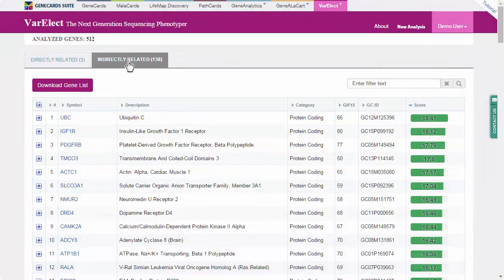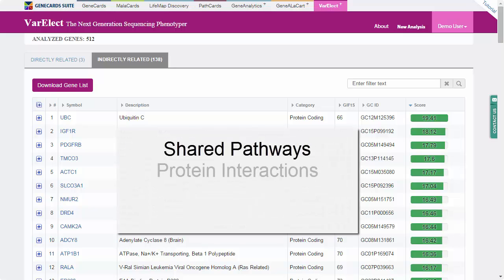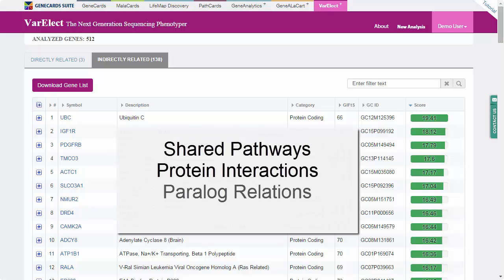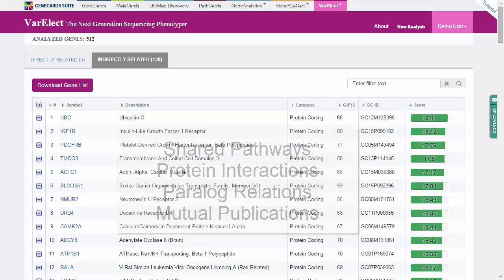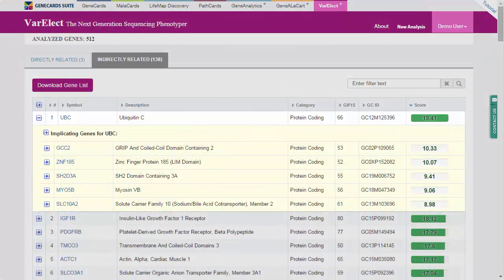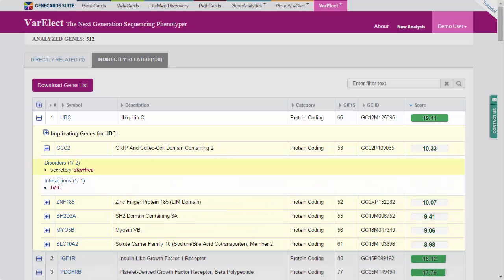Now let's take a look at the second tab — genes that are indirectly related to the phenotype. This information is especially relevant in cases where strong direct links to the phenotype were not found. These genes are associated with the phenotype based on shared pathways, protein interactions, paralog relations, and mutual publications. Expanding the row for the first indirectly associated gene, UBC, shows up to five genes which implicate UBC as associated with diarrhea and their scores. Here we can see that diarrhea was associated with the GCC2 gene, and that GCC2 and UBC connect via a protein-protein interaction.